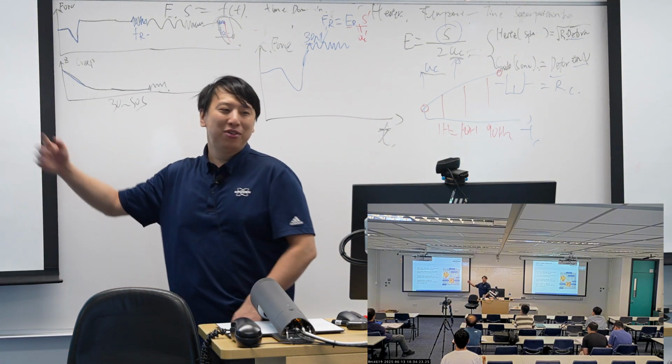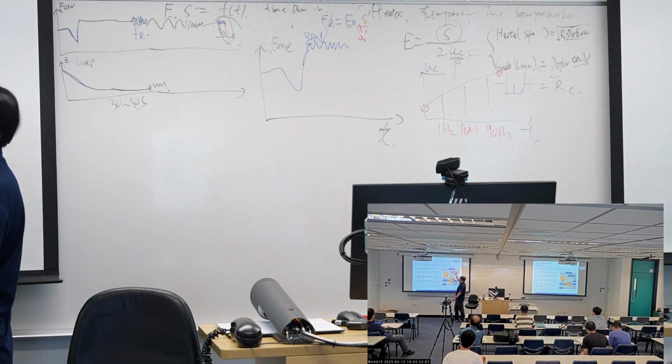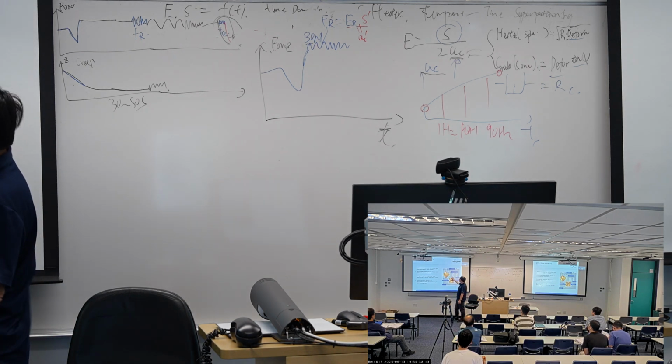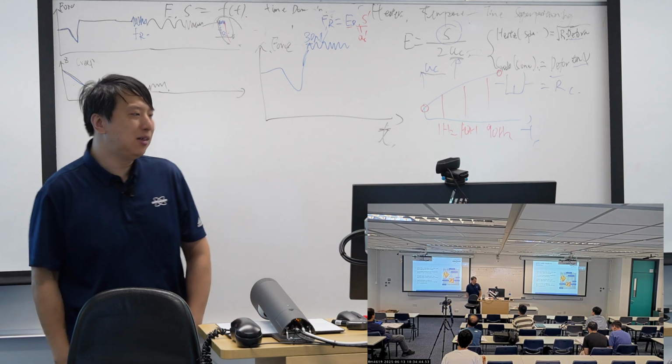Okay, but the MirrorView has its advantage. Usually in the AFM we are just looking at a certain area, and we don't know what the other area is. We cannot change area easily, but with the MirrorView we can see the relative positions of different scans. So it has its advantages.